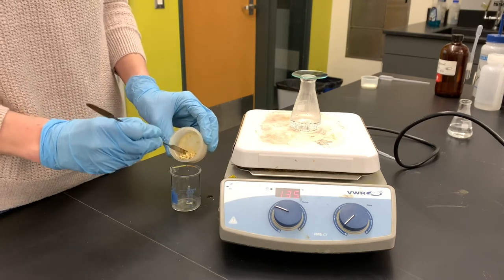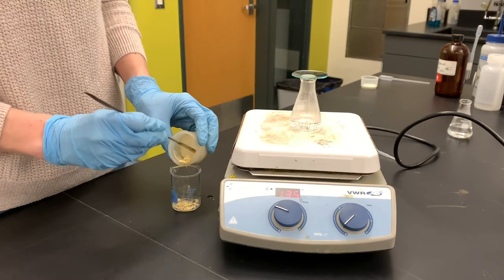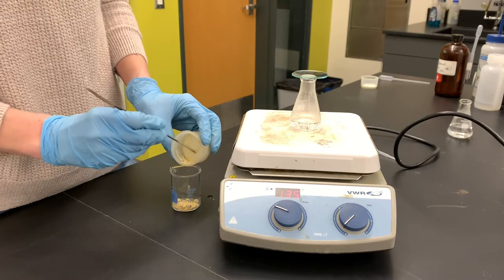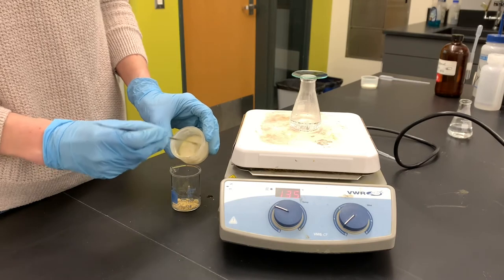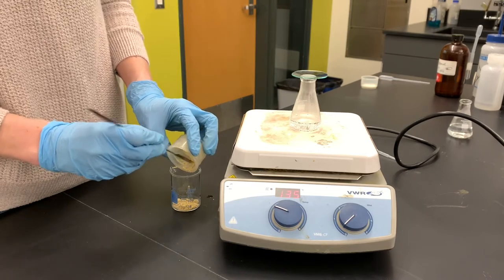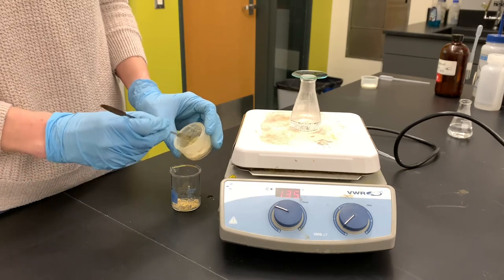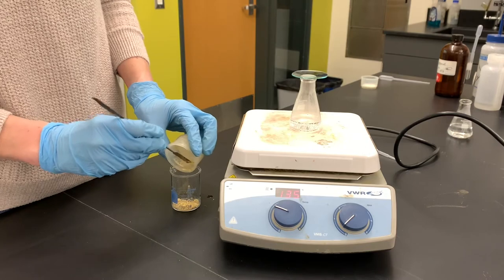So I'm transferring it into this beaker to recrystallize, and on the hot plate, I am heating up a solution of 50% ethanol. That's what we'll be using as the recrystallization solvent. And because this didn't have a chance to dry at all, I want to be really careful when I'm doing this. I don't want to scrape any of the filter paper because the filter paper is still really wet.